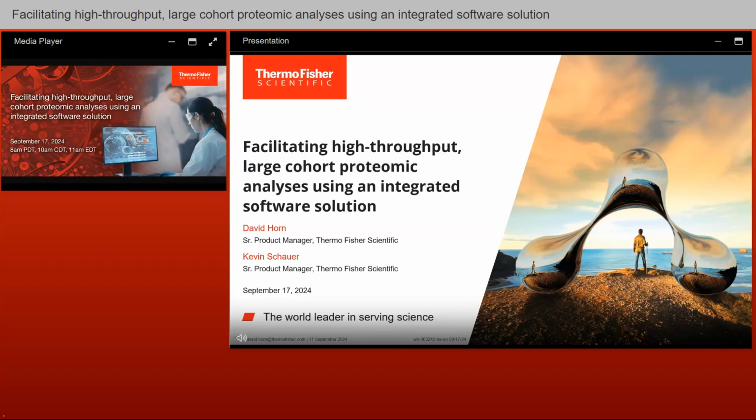Thank you very much for joining this webinar. Today, we are going to give you an overview of the Thermo Scientific Proteome Discoverer software and the Thermo Scientific Ardia Platform for proteomics data analysis. We will show you throughout this presentation how these two platforms work together to analyze complex proteomics datasets. I am David Horn, Product Manager of Proteome Discoverer, and I will lead the first part of this presentation.